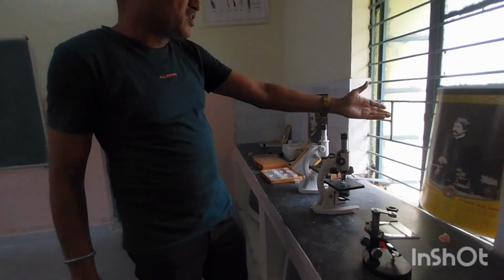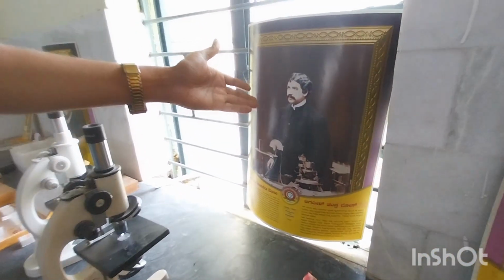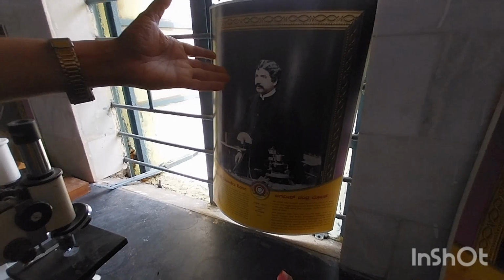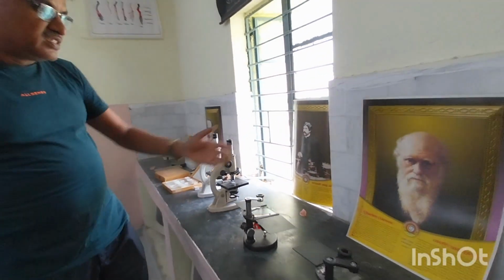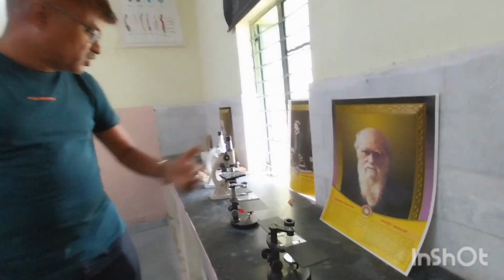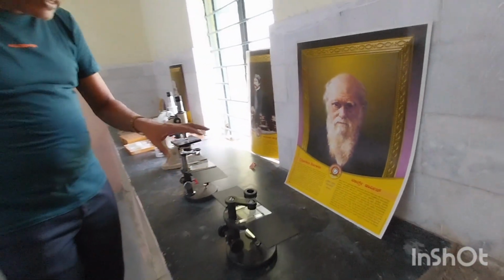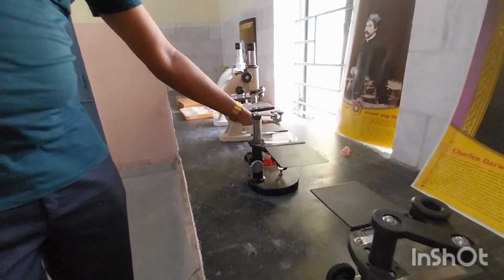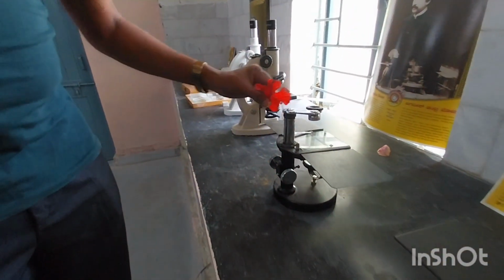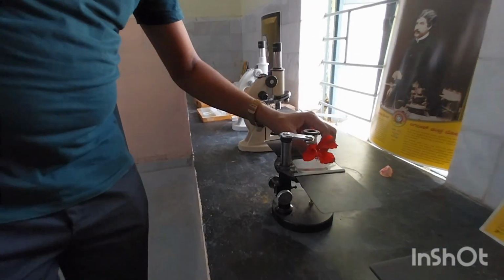And this is also our Indian scientist Jagdish Chandra Bose. This scientist worked on plants and also told that plants have emotions. And this is Charles Darwin, evolutionary scientist. Here also you are getting the microscope. This is called the dissecting microscope. This is to see the root, stem, leaf in large quantity. We can see this root, stem, leaf under this in large quantity.